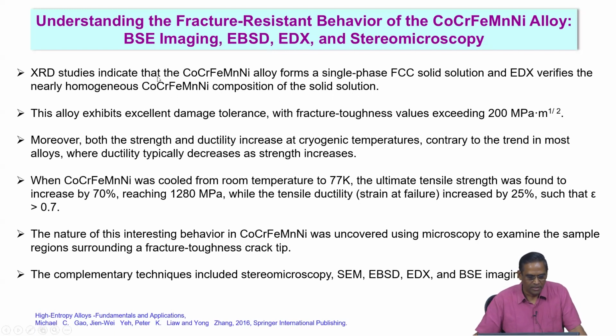The XRD studies indicate that this alloy forms a single phase FCC solid solution, and the EDX verifies the nearly homogeneous cobalt, chromium, iron, manganese, nickel composition in a solid solution. The interesting property is this alloy exhibits excellent damage tolerance. What do you mean by that? What do you mean by excellent damage tolerance?